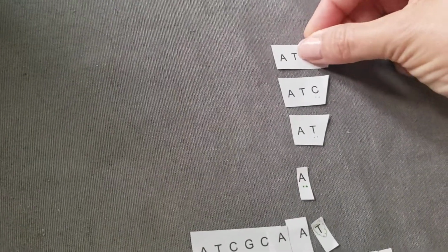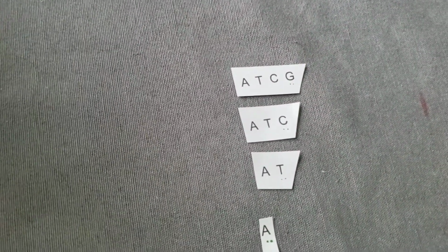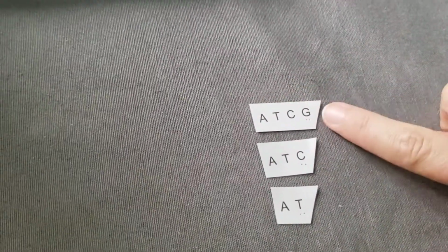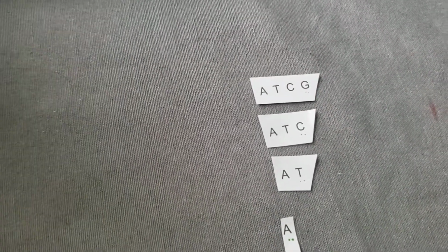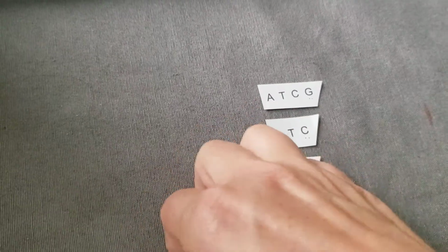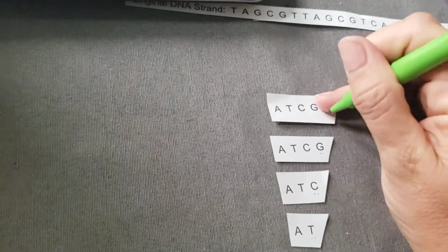So again, if I kept going, the next piece that would come through based on size alone would be this one. And let's say its G was fluorescent. That's why it only ended up being this long. Once the fluorescence was selected, the rest of the build did not occur. So continuing on, the next one would be this guy, and the C would be fluorescent.